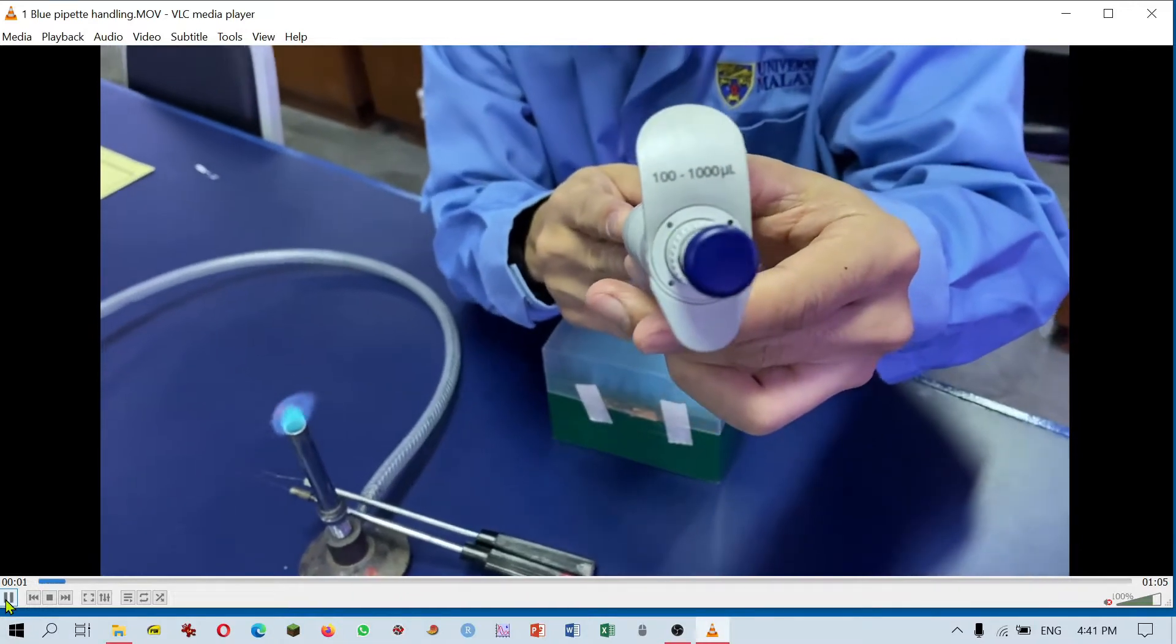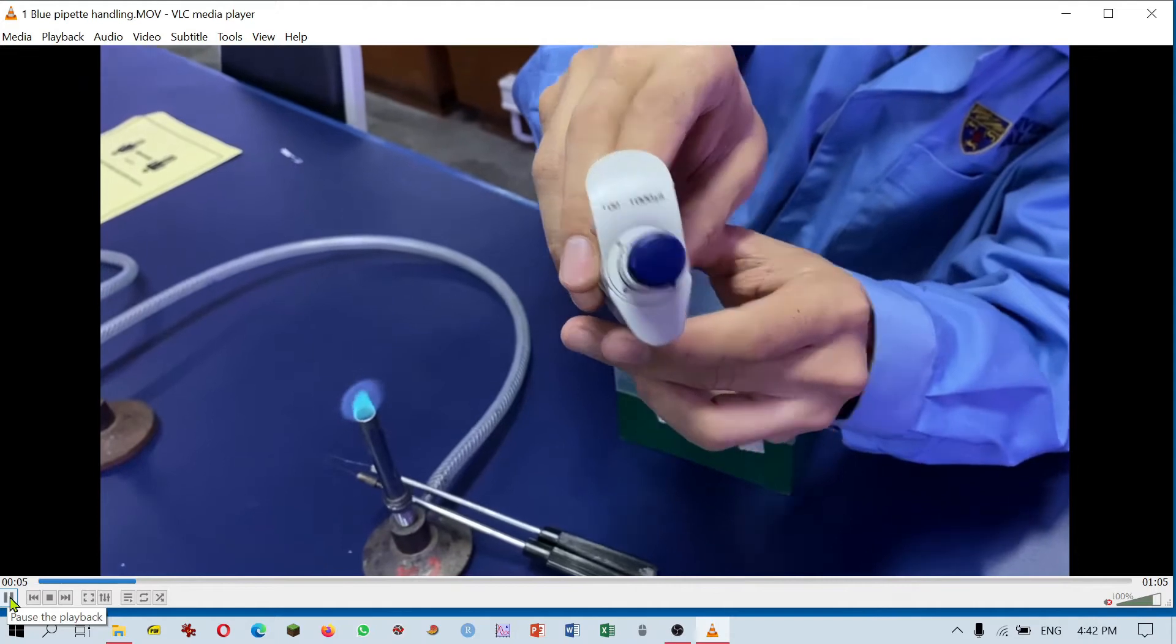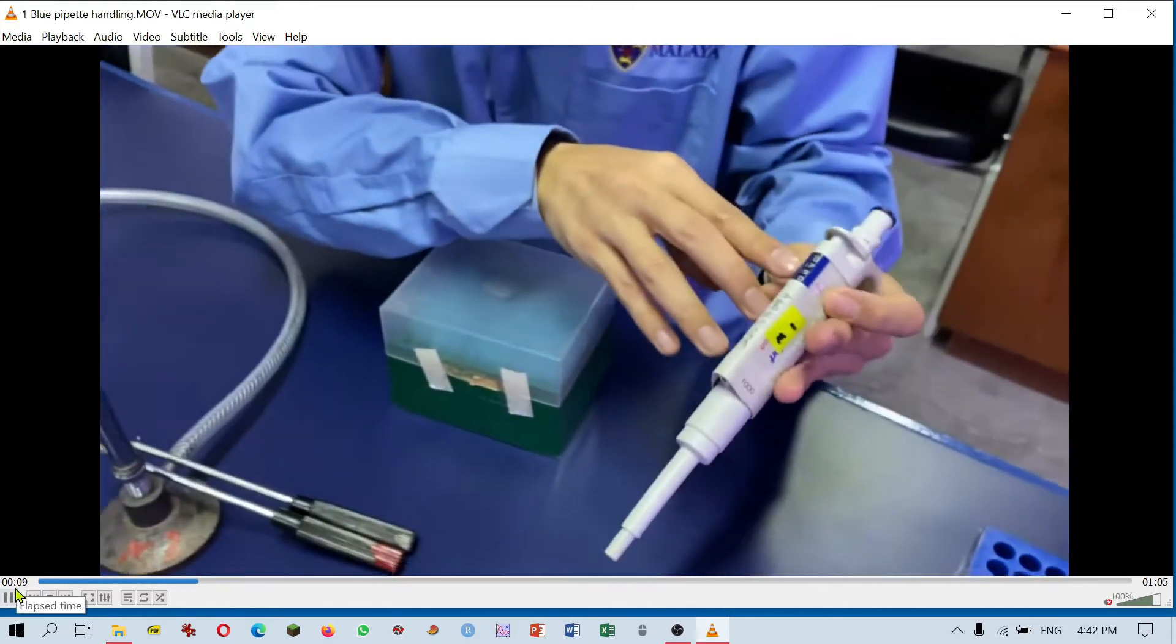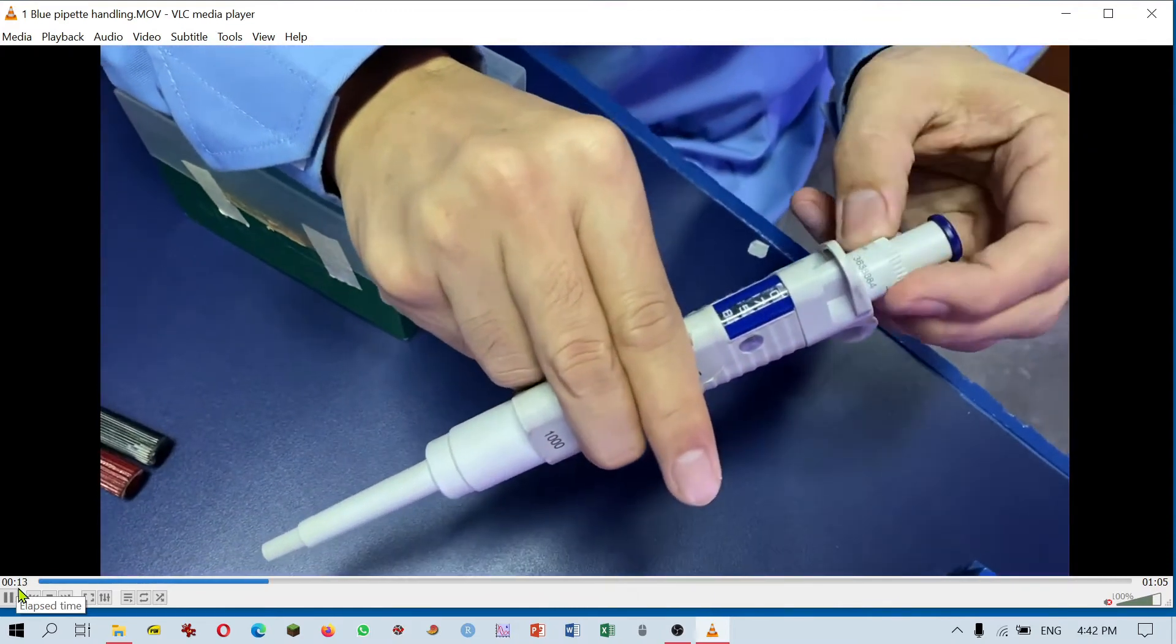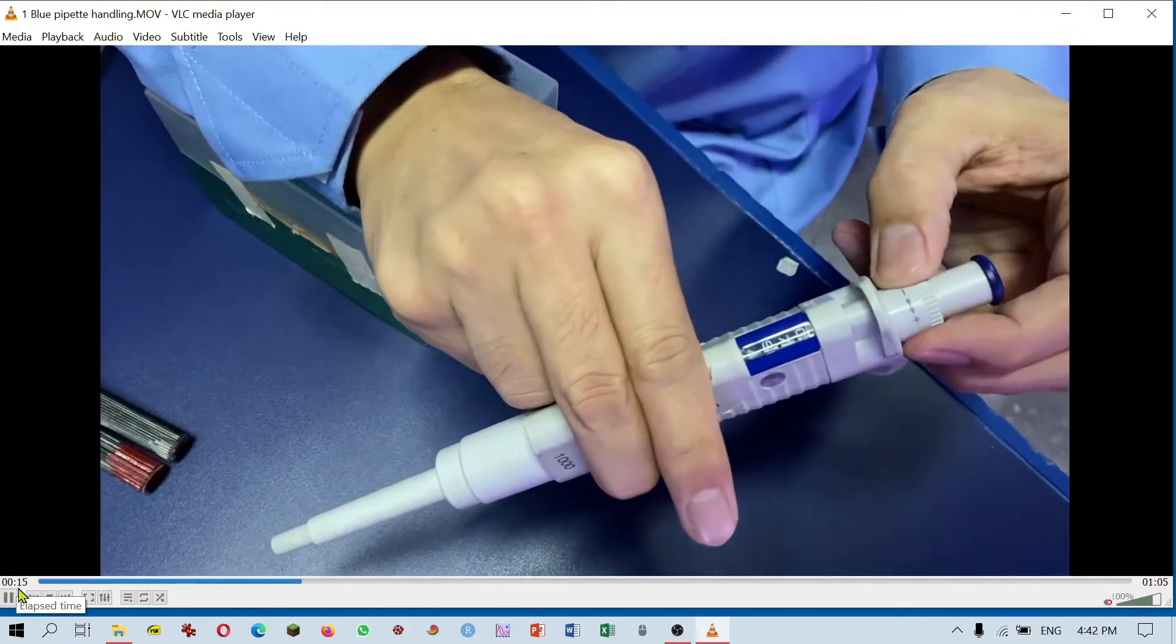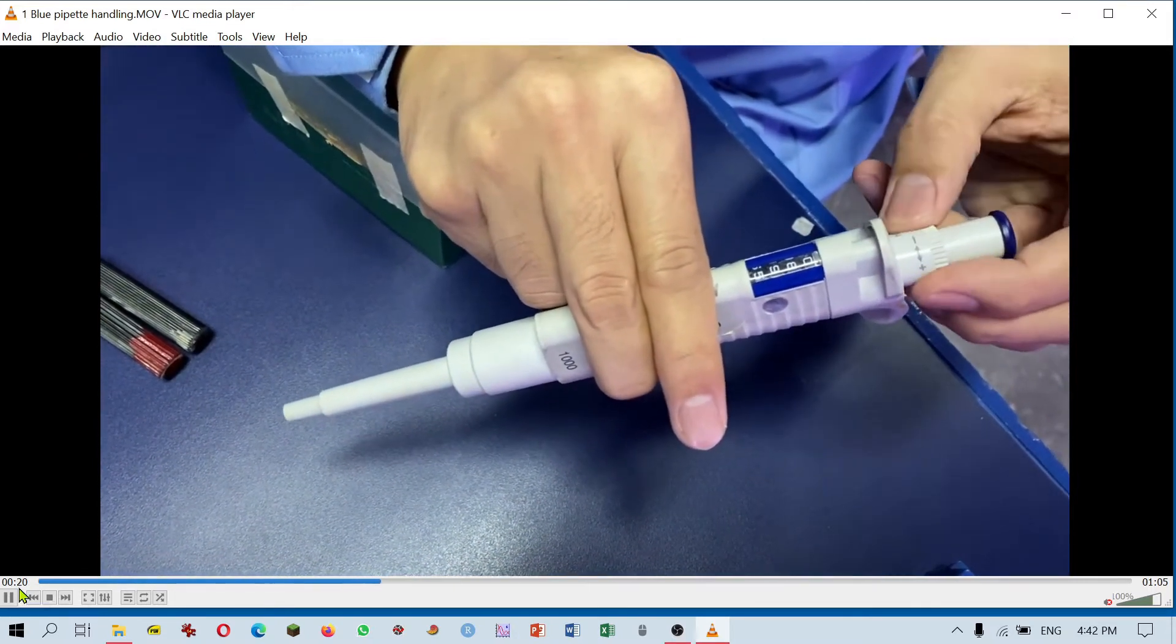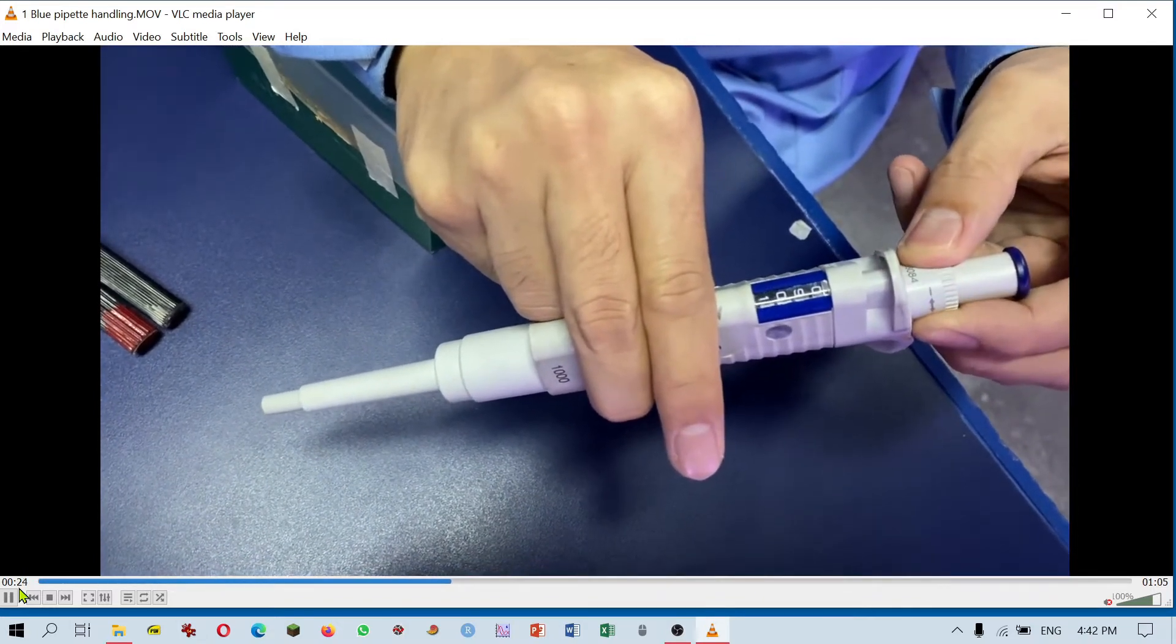This is the blue pipette with a volume range of 100 to 1000 microliters. You can see the numbers here that indicate up to 1000 microliters, so we're setting it to about 900 microliters.